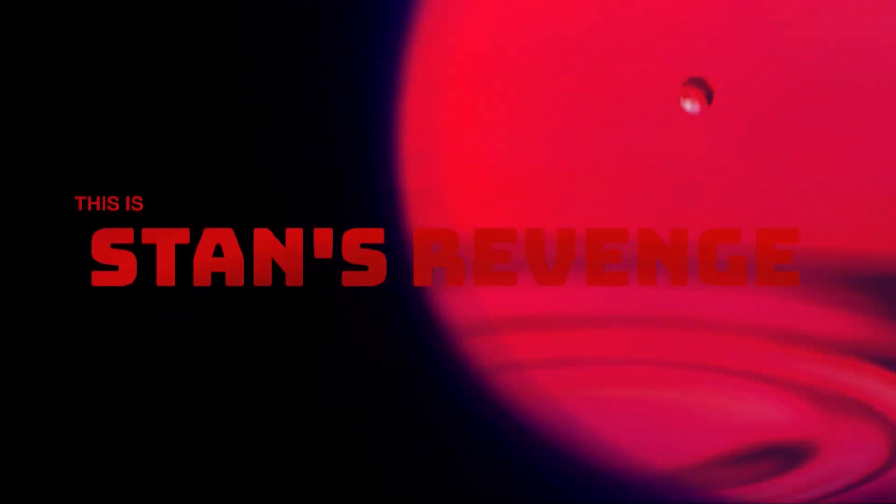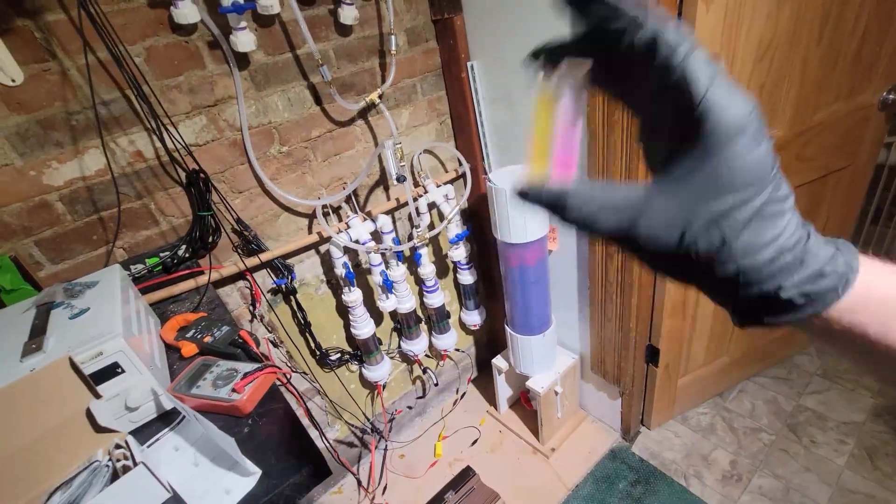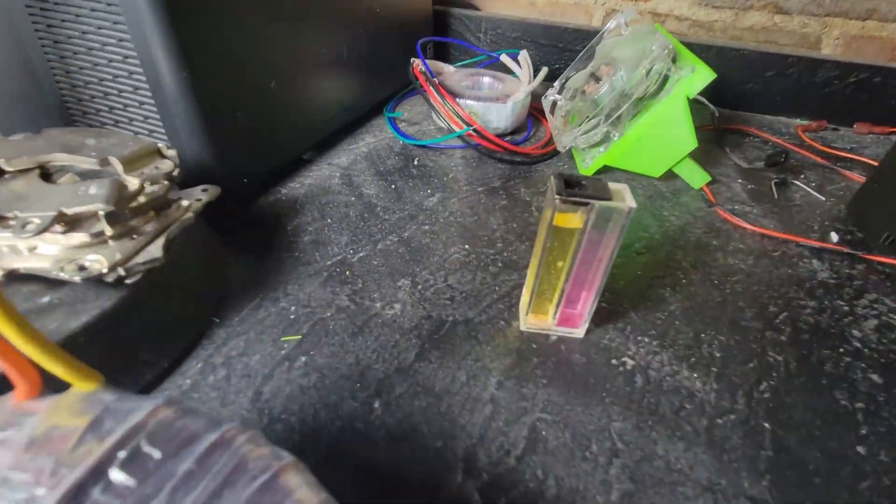This is Stan's Revenge. The payload is now inserted, and now we shake. How long? It says shake well, so I think this is well enough. Now we wait for six minutes.